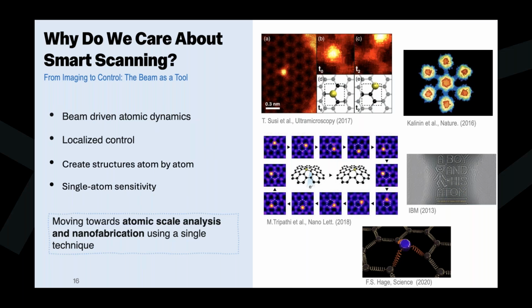And now if you have the ability to really write the electron beam and control it, you can think about synthesizing structures even atom by atom, and really using the electron microscope tool as almost a synthesis or materials control tool, or another way to control in situ experiments. And this also links into our improved ability to use the electron microscope. More and more we're able to do studies where we can actually see individual atoms and study the structure change in these materials. So this is linked to other advancements going on in the field.